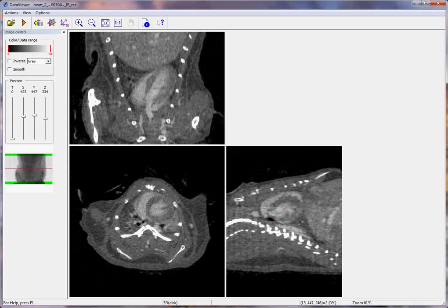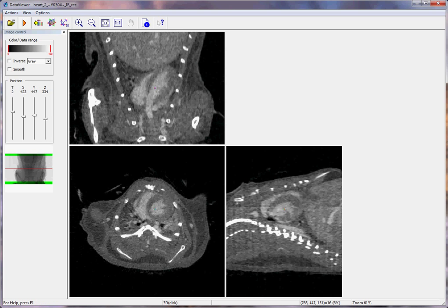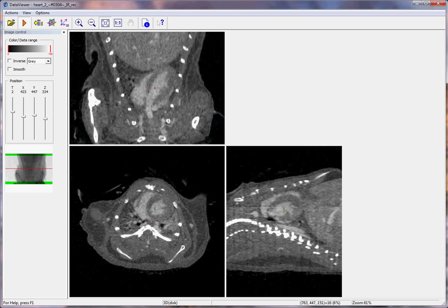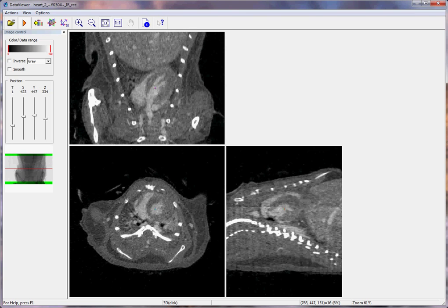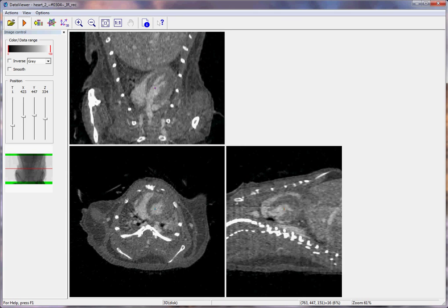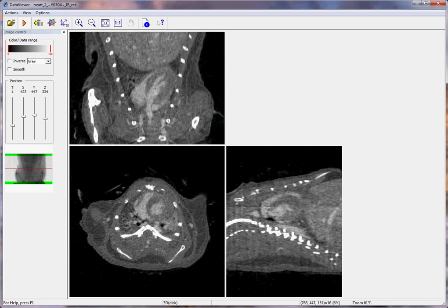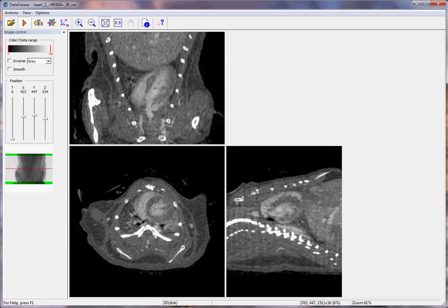Now just click on the Animation button and we will see the animated cardiac cycle. The program is alternating between the four reconstructions corresponding to the four cardiac phases. Thank you.